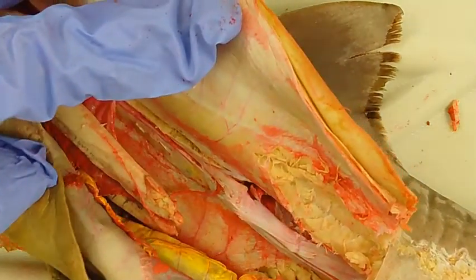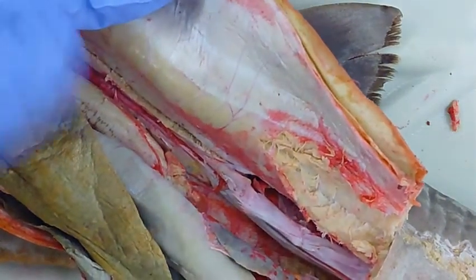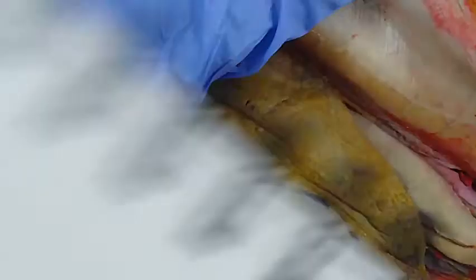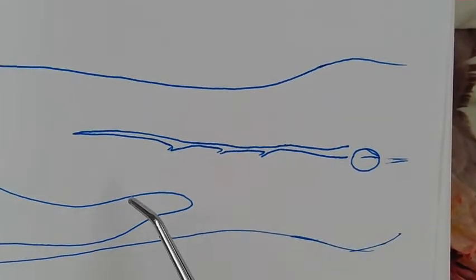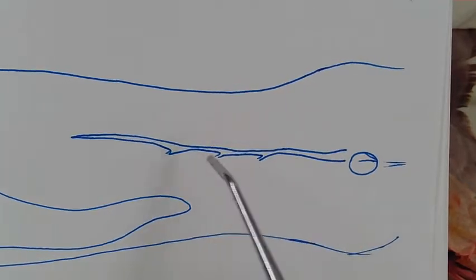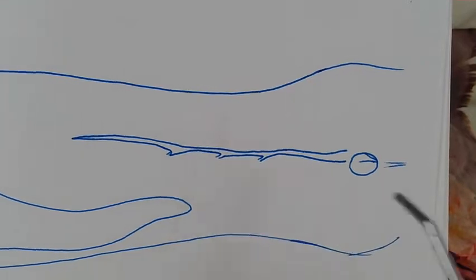So it's not quite apparent in the actual specimen here, so I drew a quick little thing. So here we have the liver, and this is our renal portal vein. This is our caudal vein down here.